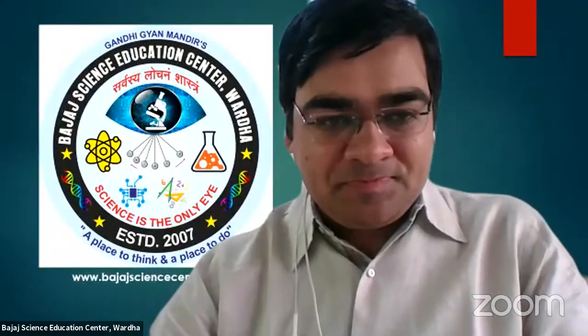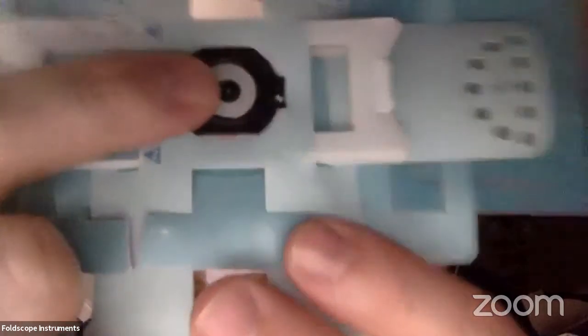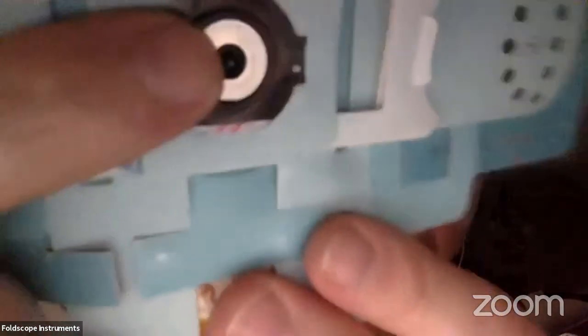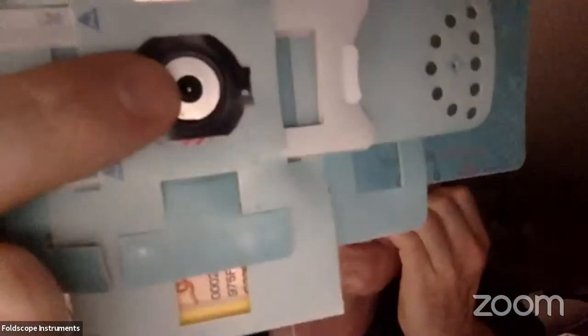So the different components. Essentially, this is what it looks like. And the lens is the part in the middle there. You can see it's mostly obscured by a black piece of plastic, which serves as the aperture, but the glass ball is inserted into the plastic there, and that is what really does all of the magnification. So maybe I'll just go over the details of the Foldscope first, as you mentioned, and then I'll go into the details of the lens. How about that?